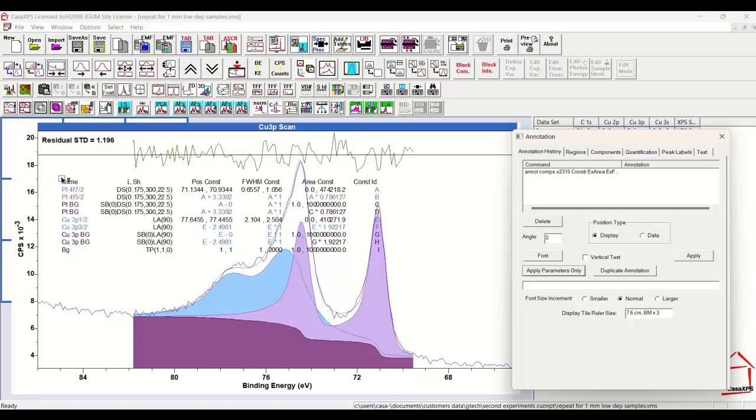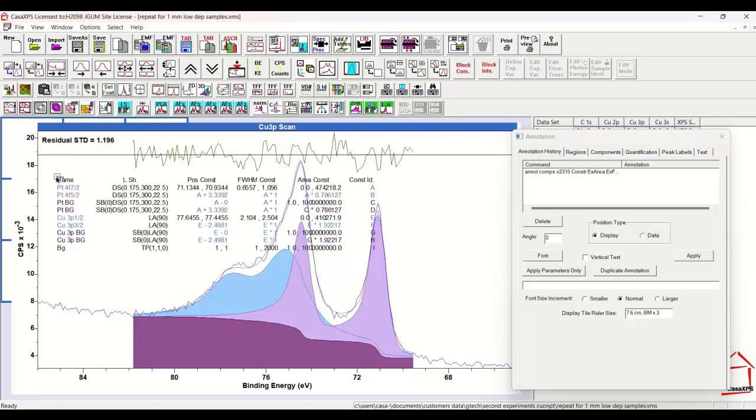The peak model is defined in terms of constraints. I would also argue that line shapes are another form of constraint, but these are only suitable for fitting the data provided we have introduced appropriate constraints between the fitting parameters such as area, full width half maximum and position.